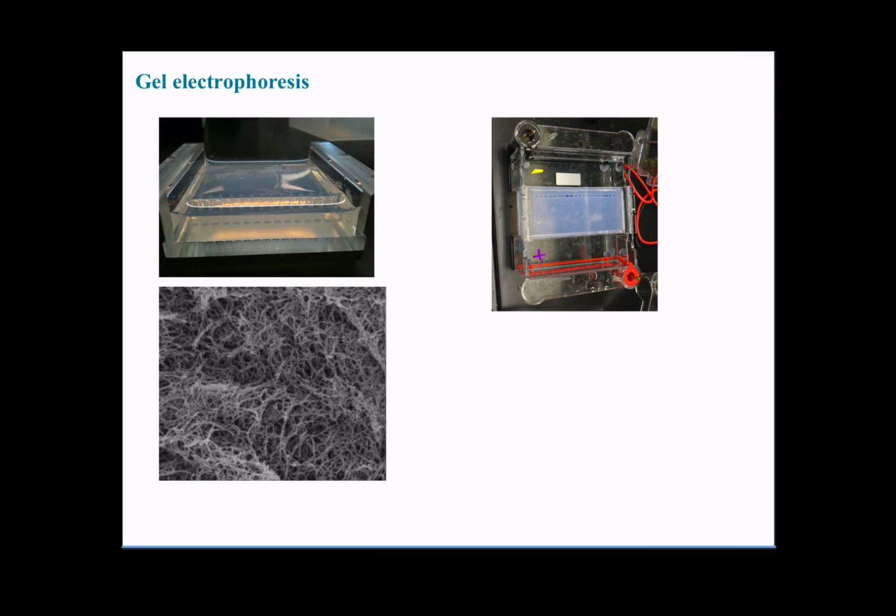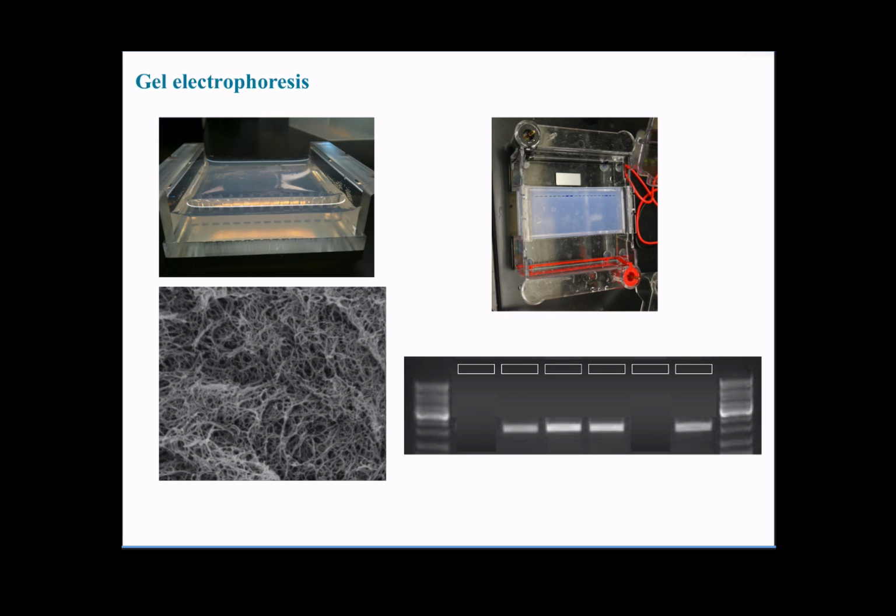So what we do is we let the samples run through the gel. There are ways we have to make sure that they don't run out of that gel, that they don't come out on the other side of the gel. So we try and keep the samples within that slab of the agarose gel. And after we've run those DNA molecules some distance, we can reveal their presence using special chemical dyes that will bind to DNA and have the unique characteristic of fluorescing under either ultraviolet light or some type of special light, typically UV light, right?